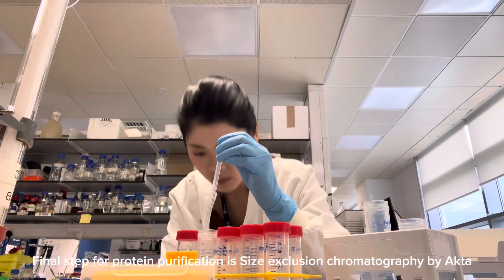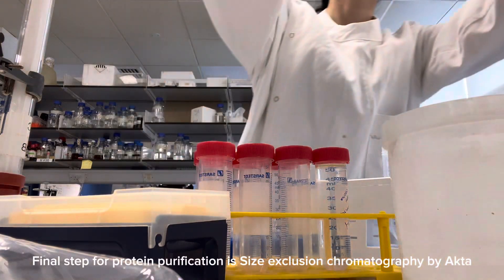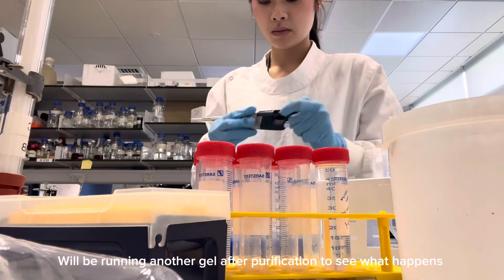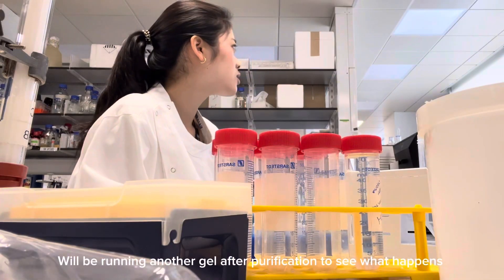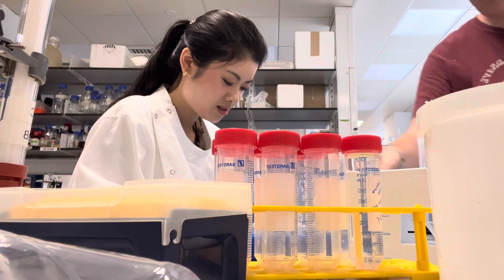The final round of protein purification will be size exclusion chromatography using the ÄKTA. The ÄKTA separates the sample into different fractions. I'll be running another gel to see what happens after purification by SEC.